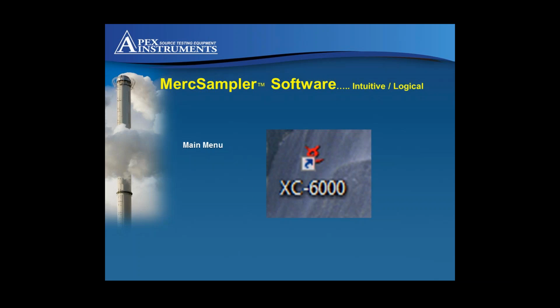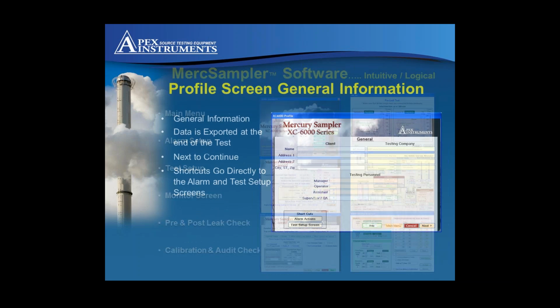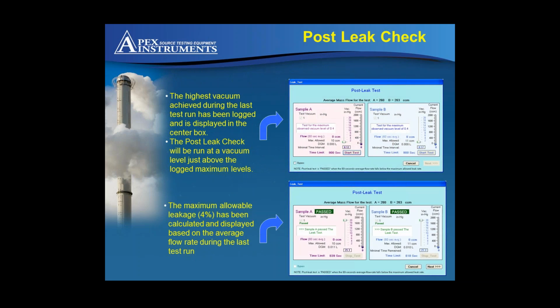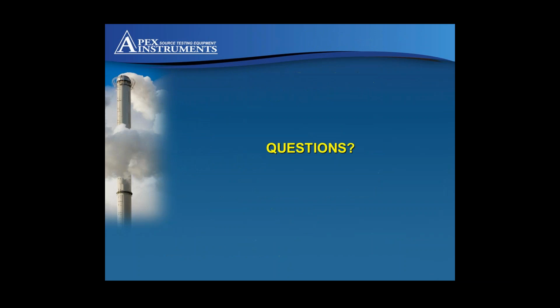Okay. And then like alarm statusing and whatnot, I'm assuming that's available for like the AC system and whatnot. It is. I mean, you've got choices there. Also, it's very versatile on the alarm. We have many alarms in the system and many conditions. If you're doing the Modbus, it's more specific alarm-wise. Now, we do have an analog that's a general alarm IO out of the rear also that you can use.